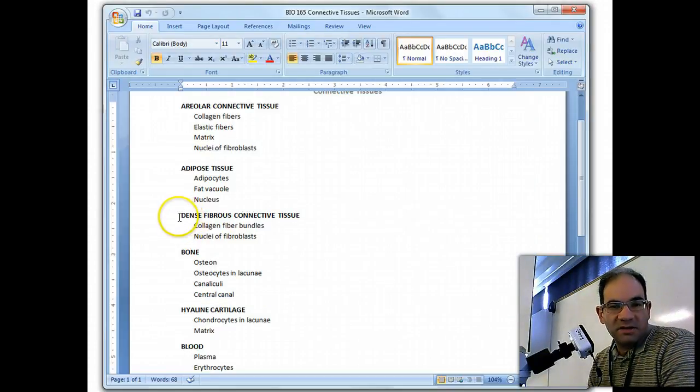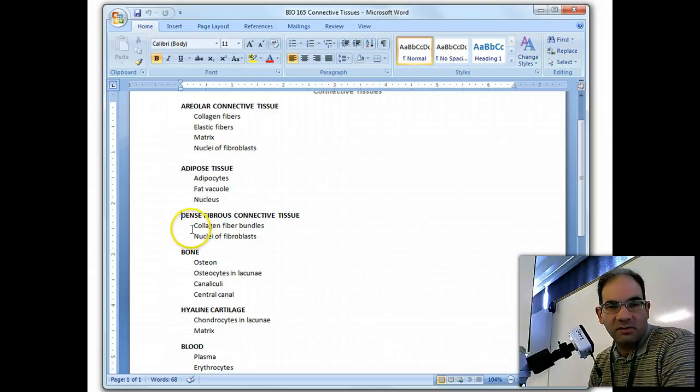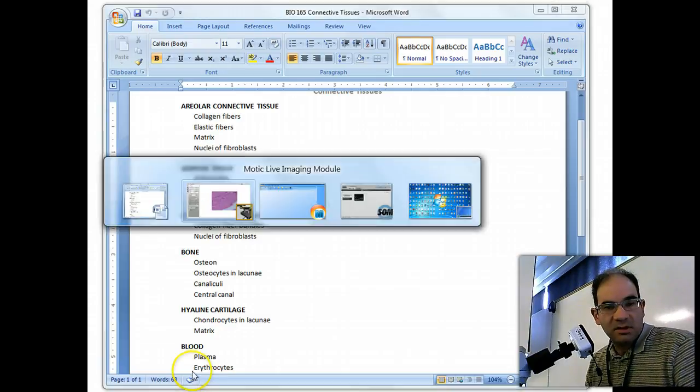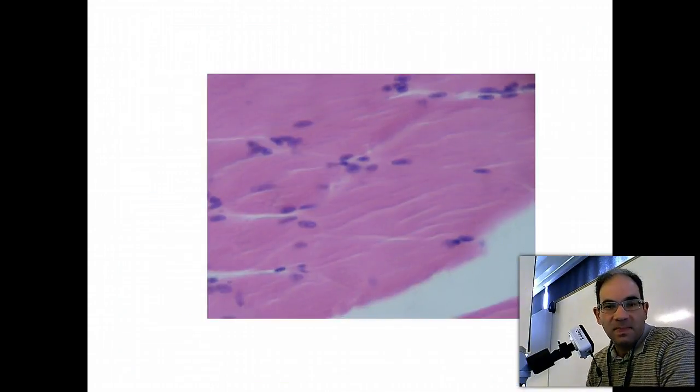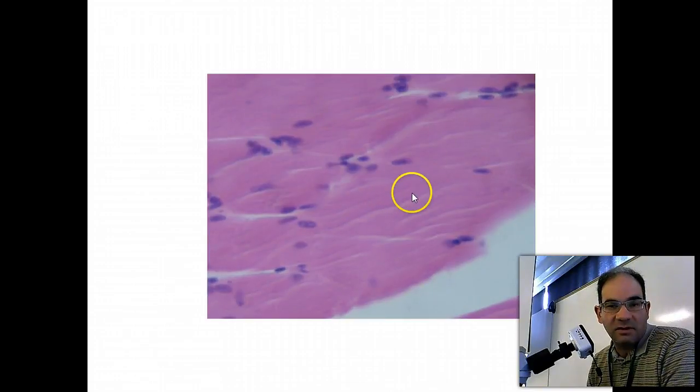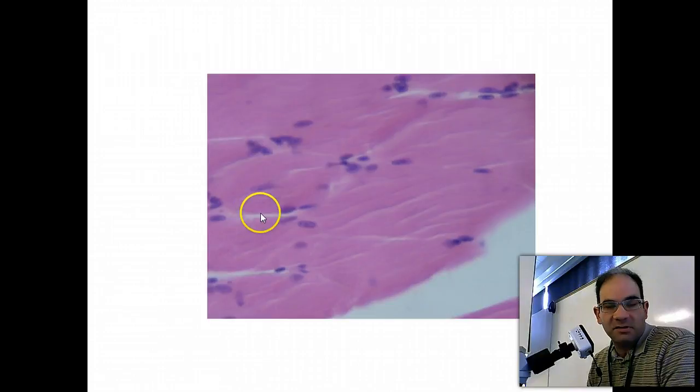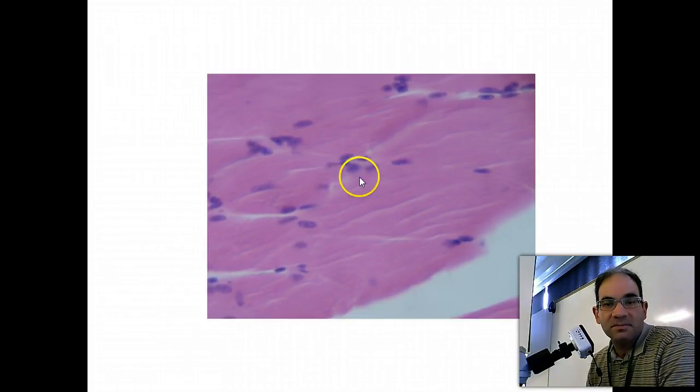Our next tissue type is dense fibrous connective tissue, and you're responsible for collagen fiber bundles and nuclei of the fibroblasts. So here we are at 400x, and you can see this is very parallel. And so this little white space in here, this is all just open space between the fibers. Think of this like a little strand of thread. And these dark staining structures are the nuclei of the fibroblasts, and these little bundles are the collagen fiber bundles.